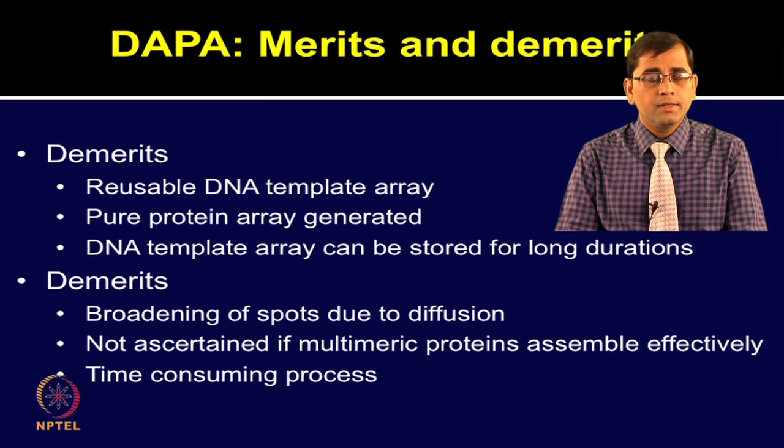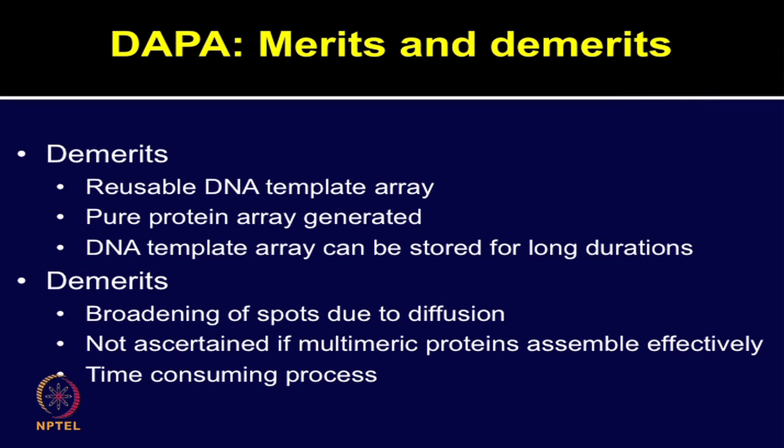However, there are certain limitations of using DAPA method, including the broadening of spots due to diffusion. It is not ascertained if multimeric protein assemble effectively. It is also a time consuming process.